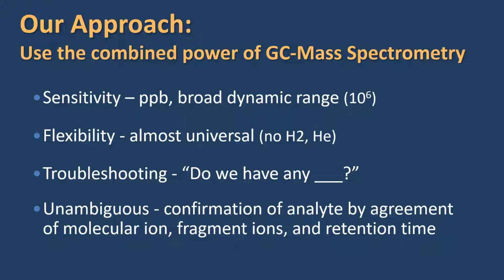It's an excellent tool for troubleshooting. So we like to say, do we have any fill in the blank? So 3 o'clock in the morning, customer calls up and says, hey, we think you've got X in your sample. Say it's acetaldehyde. We think we've got that in your sample that you're selling us, and that's going to be a problem for us. Are you checking for acetaldehyde in your streams? How do you know it's not there? That would be easy for us. We'd go to the library, we'd punch up some trace masses that are indicative of acetaldehyde. We'd add that to our method. We'd quickly run the sample and scan across it and see if we have anything that matches up.